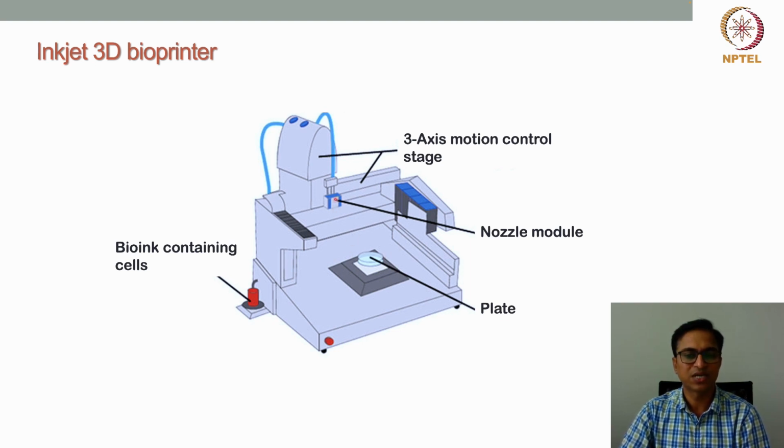Or, if you are making a 3D structure, then at the beginning the printhead will be at a certain level, and when the first layer is done, it will go up one layer, and then the next layer will be printed.